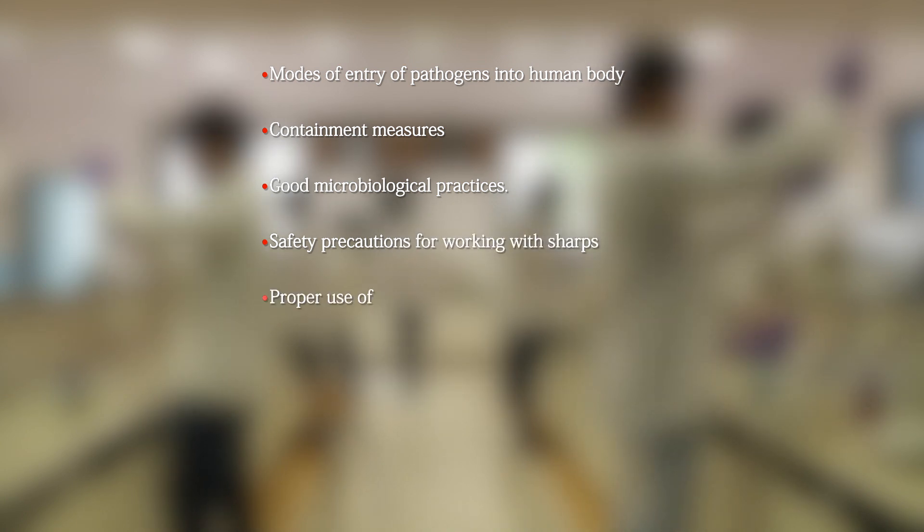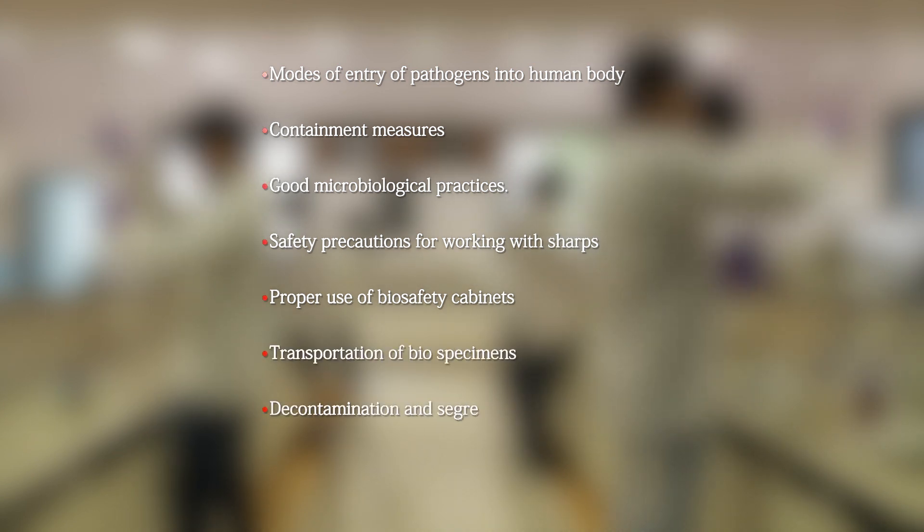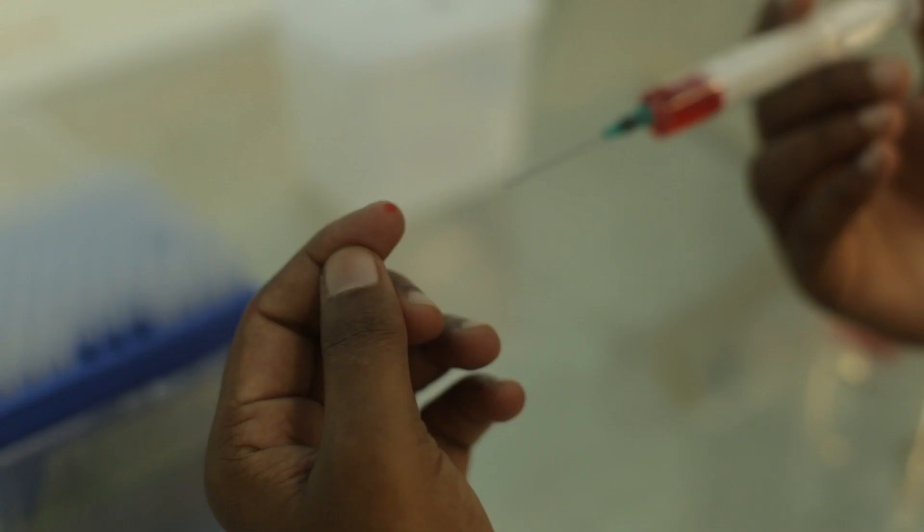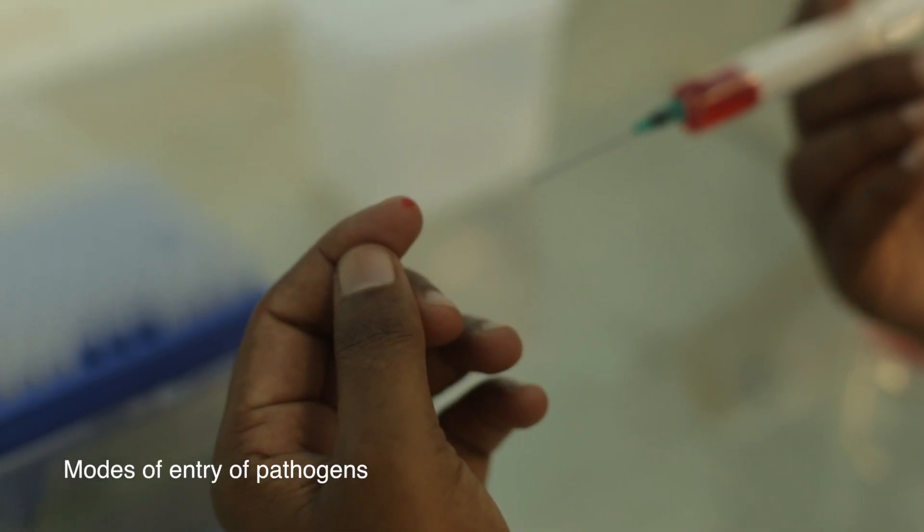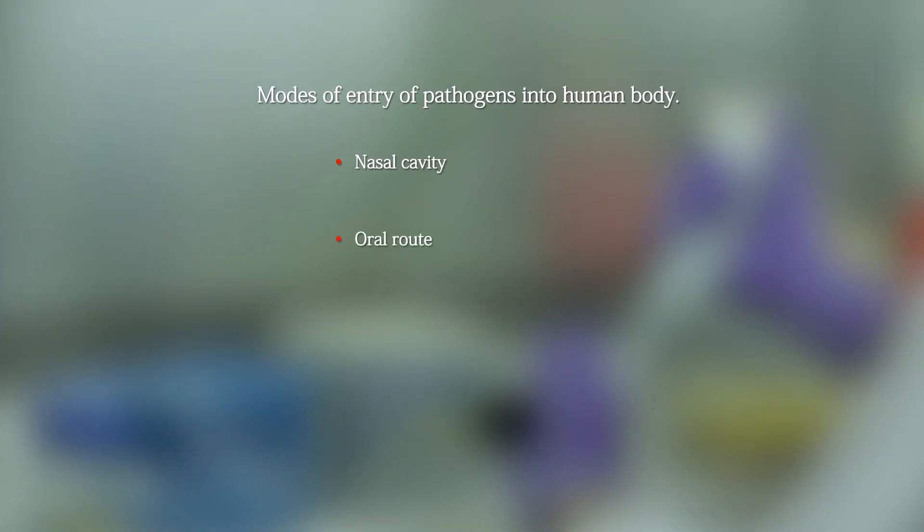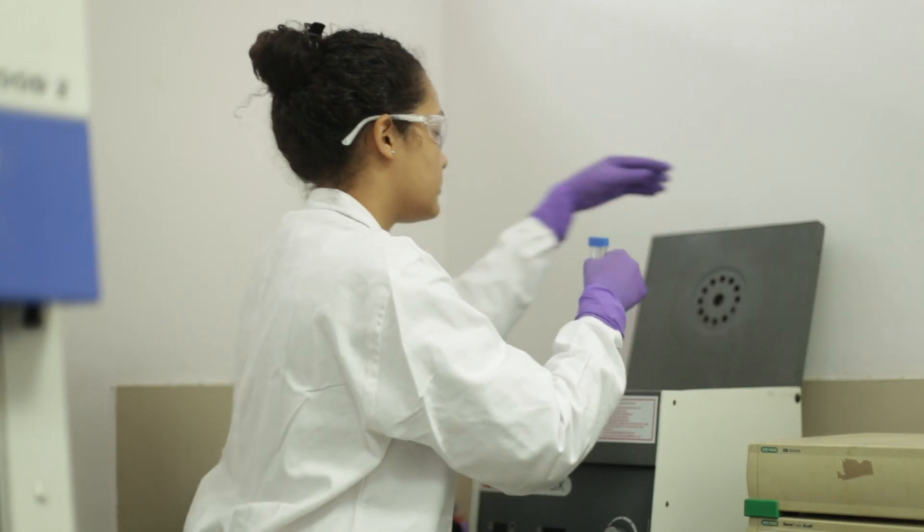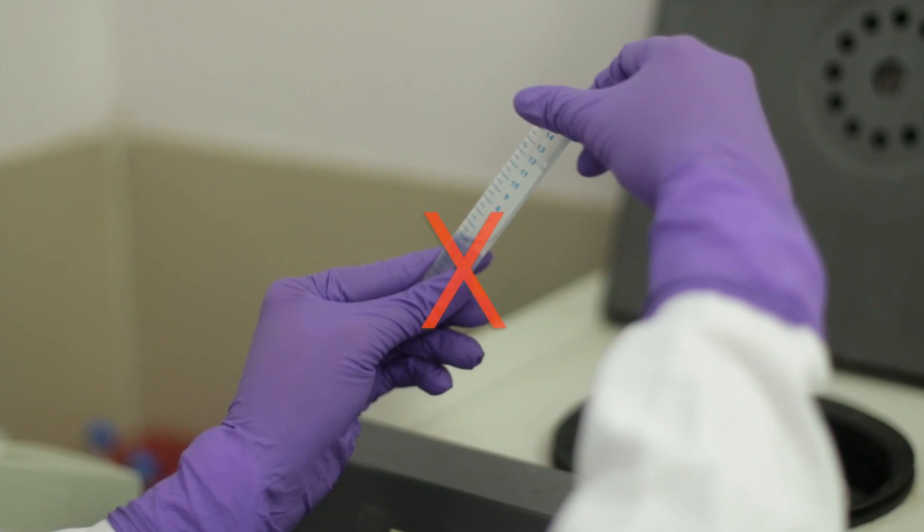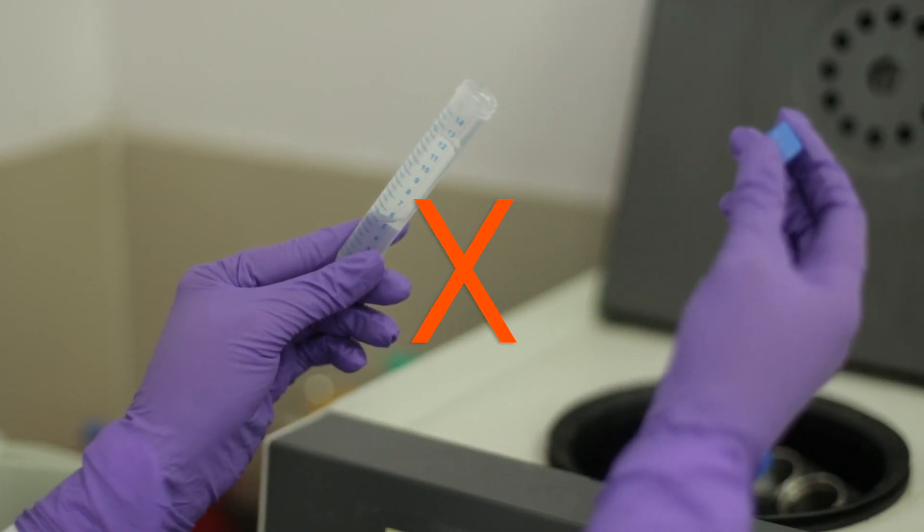Modes of entry of pathogens into the human body: Pathogens and infectious agents can be transmitted into the human body via the following routes: nasal cavity, oral route, open wounds, injuries on the skin, and splashes to the mucous membranes. Many activities like centrifuging, mixing, and streaking of agar plates can produce aerosols which are invisible to the eyes. The pathogens can enter the body if these aerosols are inhaled.